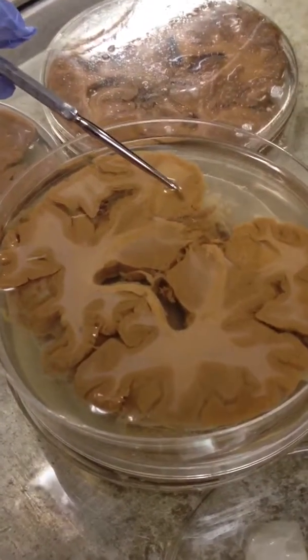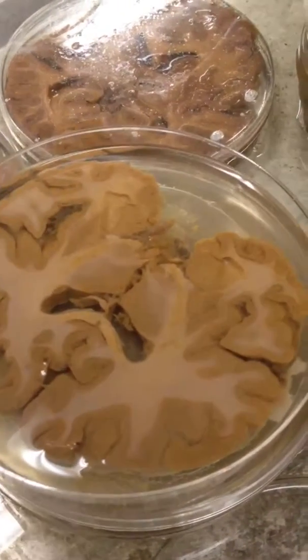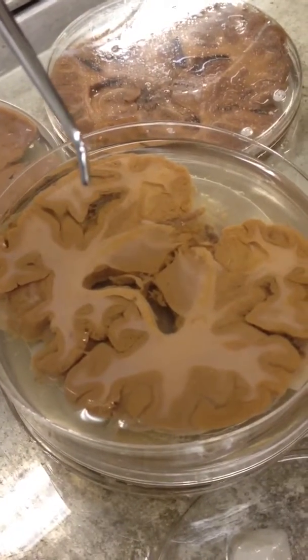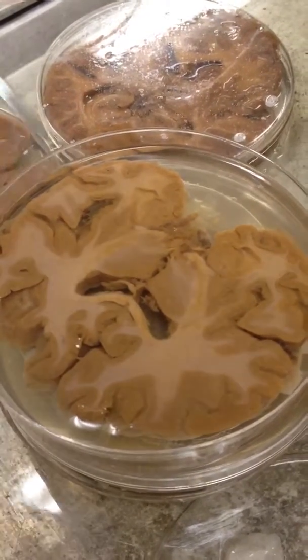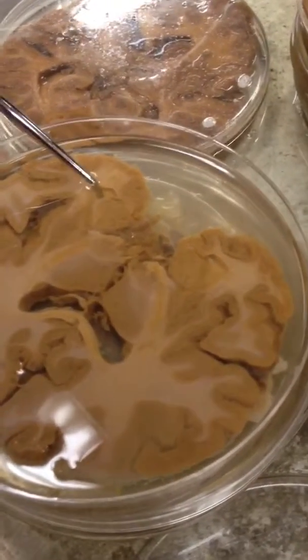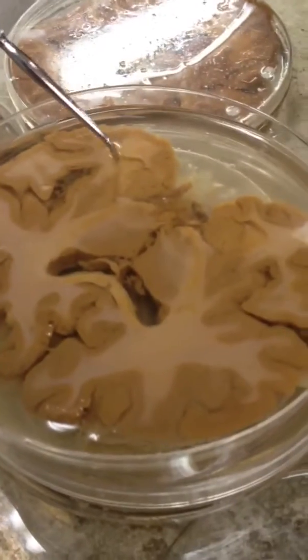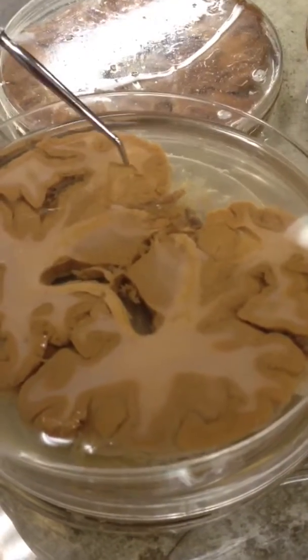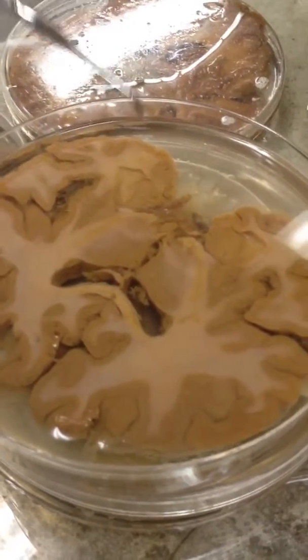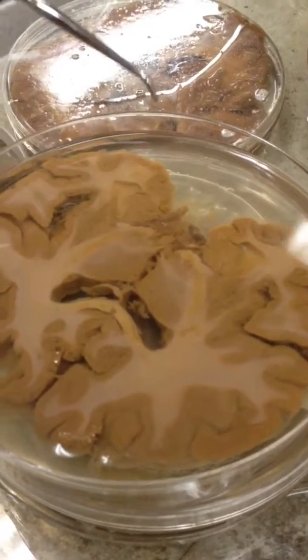Now, what's this mass of gray over here? Hippocampus. The amygdaloid nuclear. It's a hard G, though. How do you pronounce that? Amygdaloid. Can you point that amygdaloid out? Yeah, here's the pole of the inferior horn of the lateral ventricle. In the medial wall of the inferior horn, right over there, there's a mass of gray of relatively small size. So the next section back will already be gone, and that mass of gray is the amygdaloid nucleus or amygdala.